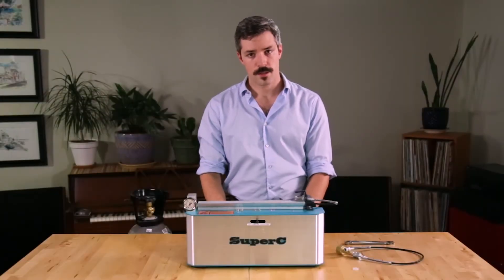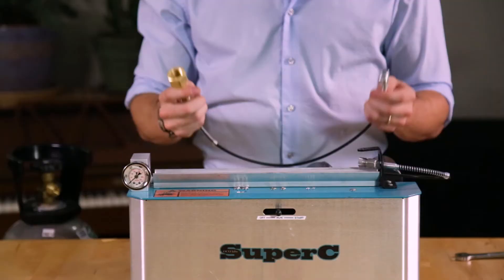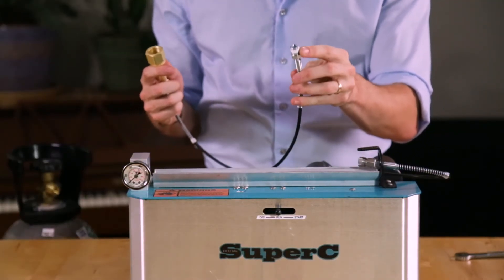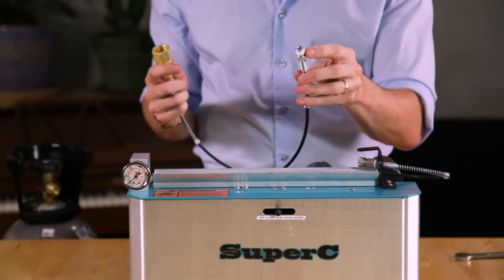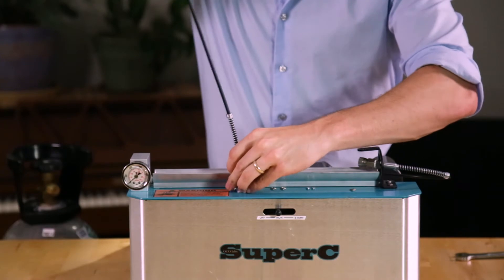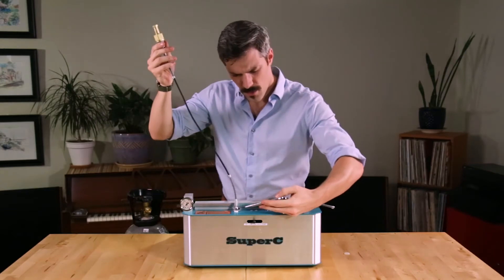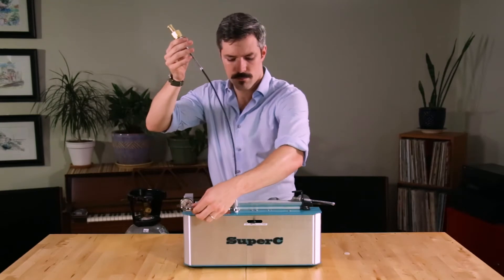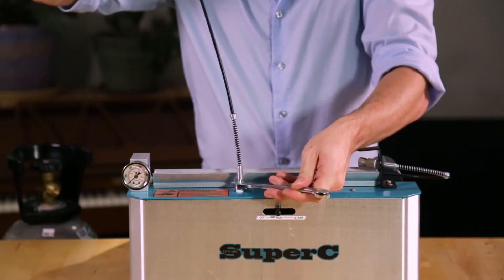With the stepper motor mounted, we can continue assembling our Super C. The next step will be to connect our tank to our system using the tank feed hose. The tank feed hose will arrive with Teflon tape on the male end. There should always be about a turn and a half or two turns of Teflon tape on this fitting. If you remove the fitting or the tape is otherwise damaged, you should put about a turn and a half or two turns of fresh tape on. Mounting this fitting, you can start it by hand, and using a 9/16th wrench, we can finish snugging this fitting. As a general rule, snug is tight enough — if it's snug enough to seal, it's as tight as it should possibly need to be.